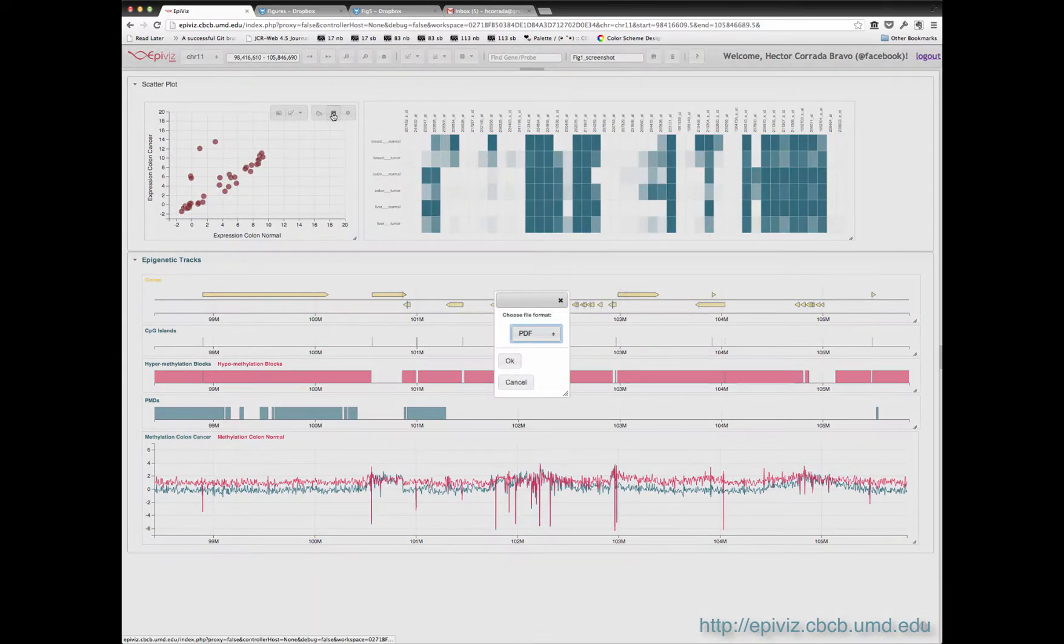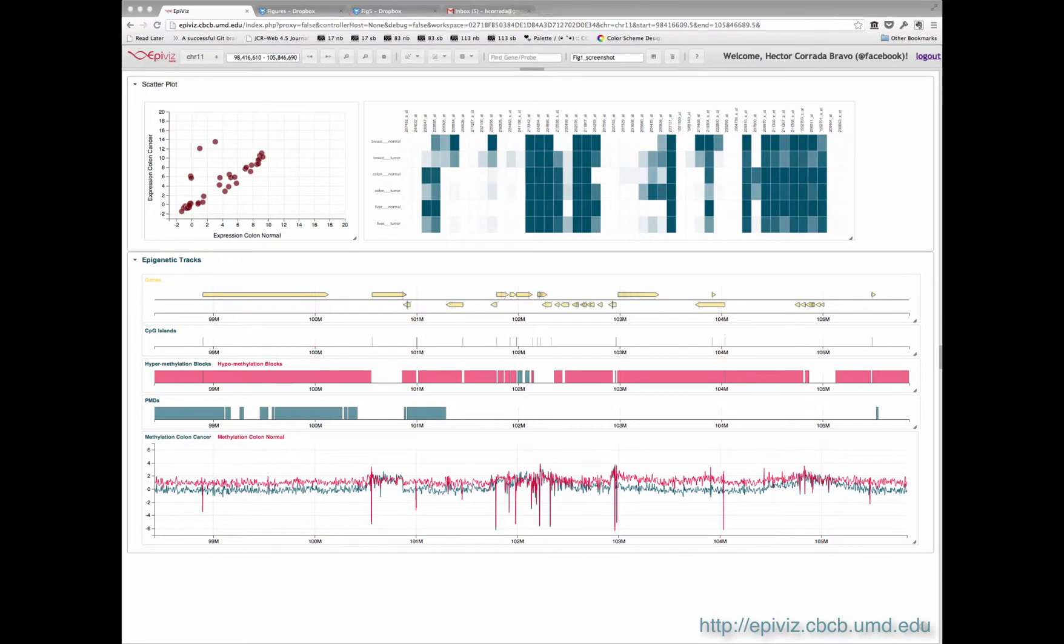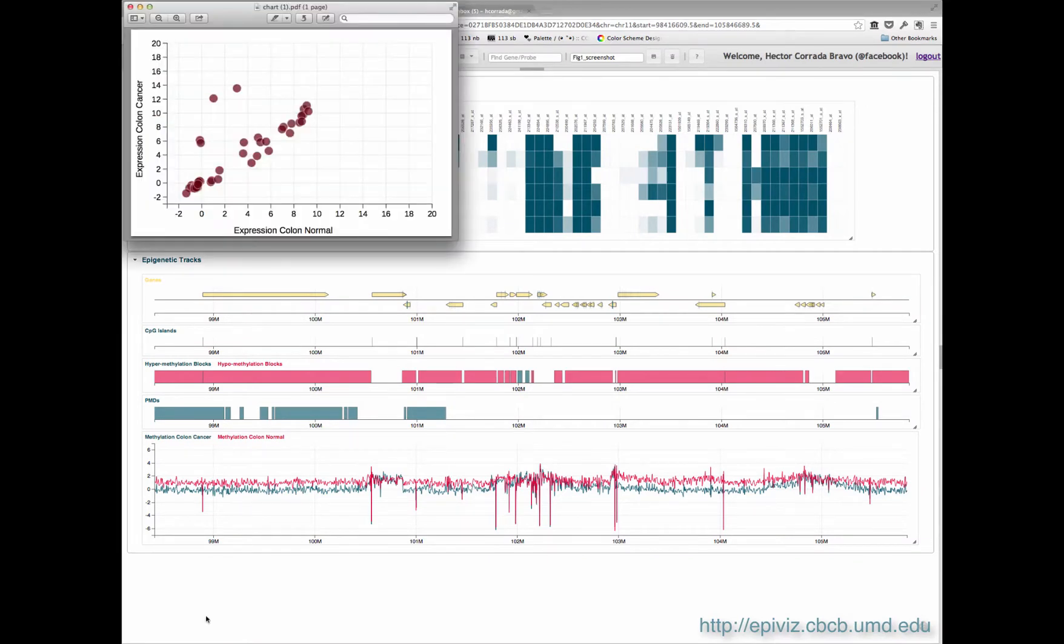And since we use d3, all tracts and plots can be saved as static image files, like PDFs, that can be used to create publication-ready figures.